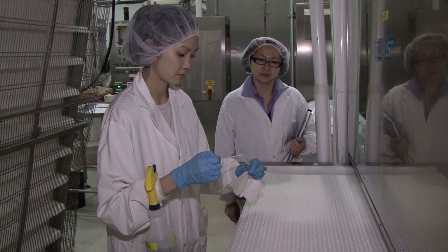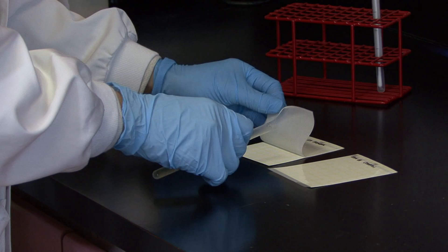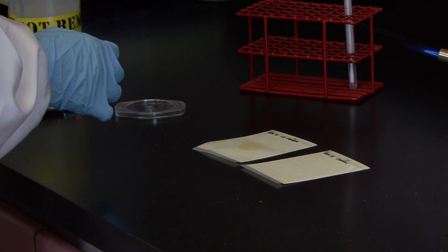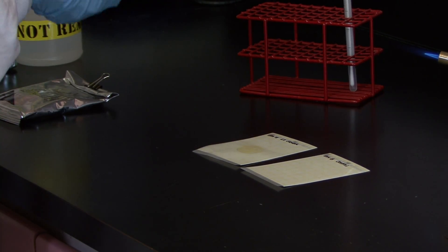She then puts the swab into a tube with a diluent, and it is then placed on petri film — in other words, it's spread on a film containing a medium that supports bacterial growth.